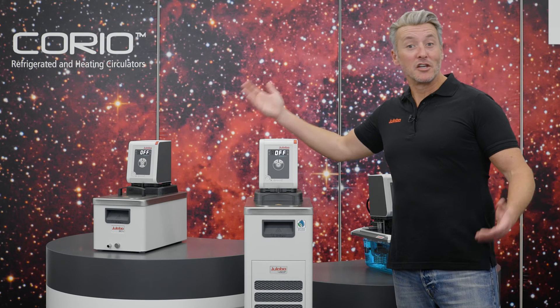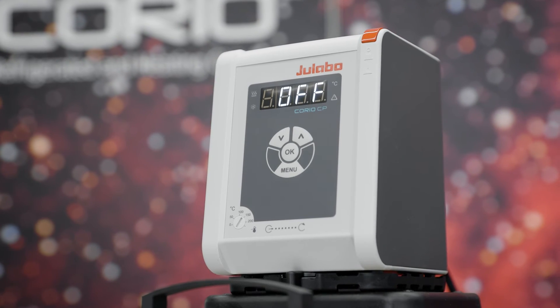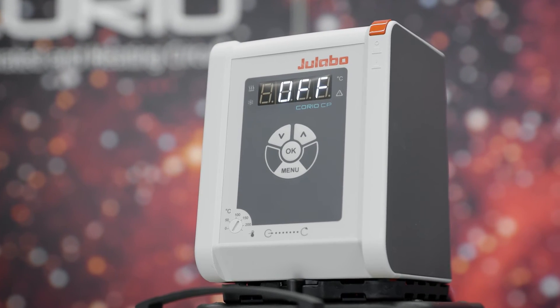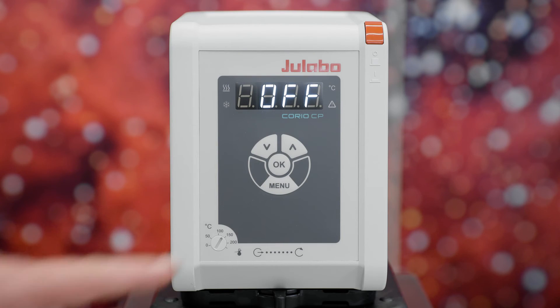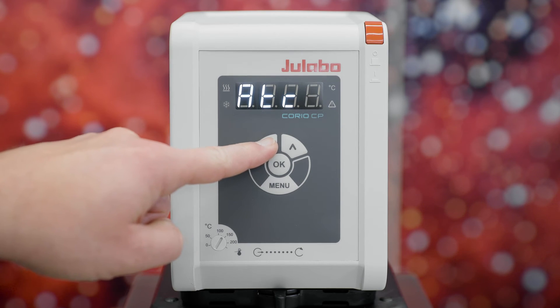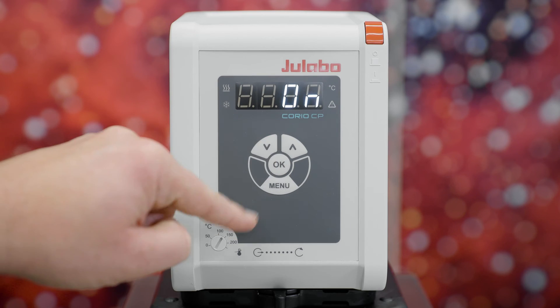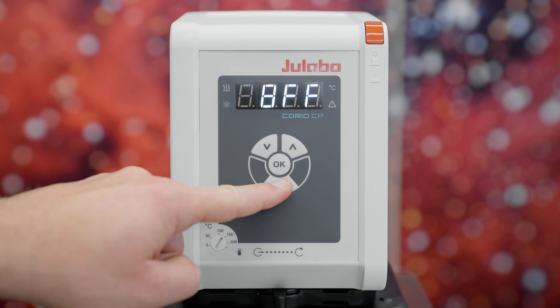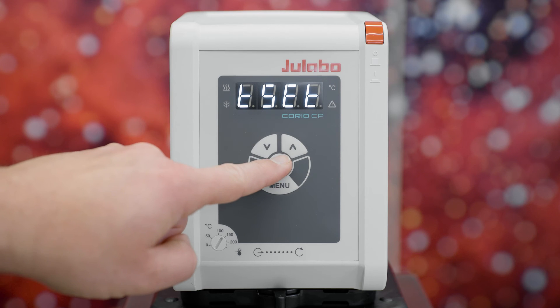The Corio CP units not only offer improved pump performance, they also offer another control element with the menu button. Shortcuts are replaced by menu navigation and expanded by additional features such as the pump output. For example, to set the AutoStart function, select the submenu CONF and set the AutoSettings to ON. To program the timer, just choose the submenu T SET.